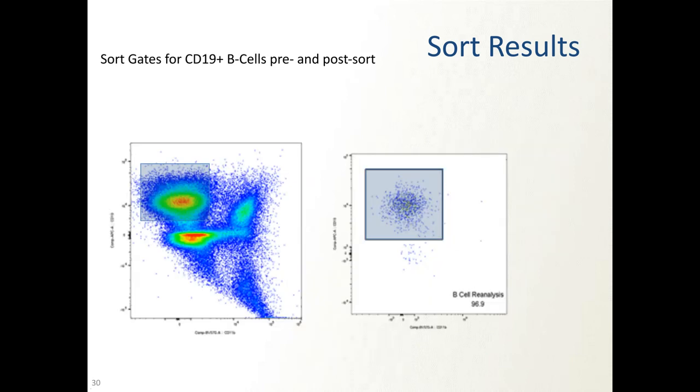When we look at the B cells, sure enough, they all sorted as B cells. And when you look at the sort, it's 96%. These are probably cells that died in the waiting, and this is probably the few represented impurities or maybe a little bit of passengering or something. But this sort worked. We're not seeing unusual distributions here to suggest that the delays weren't working right.